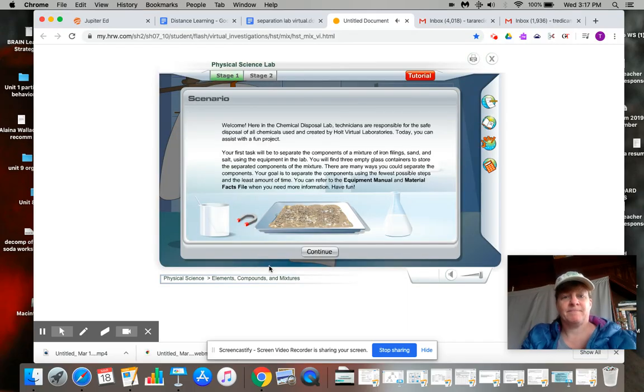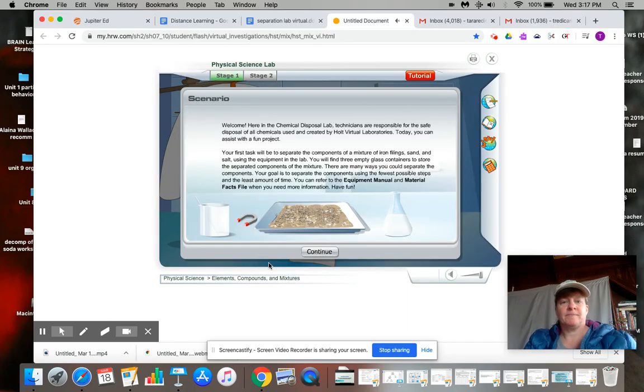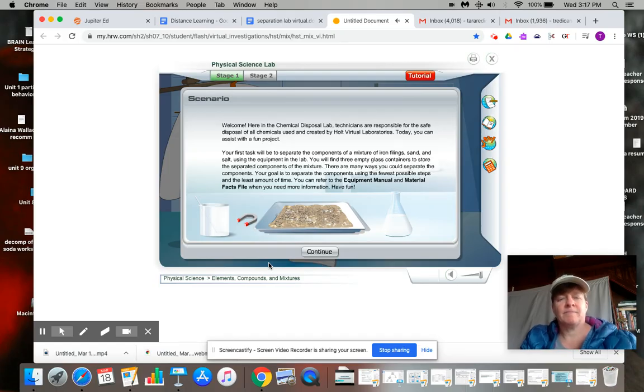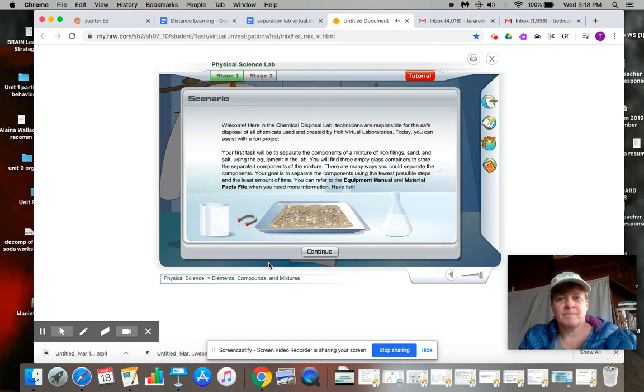Welcome. Here in the Chemical Disposal Lab, technicians are responsible for the safe disposal of all chemicals used and created by Holt Virtual Laboratories. Today you can assist with a fun project.